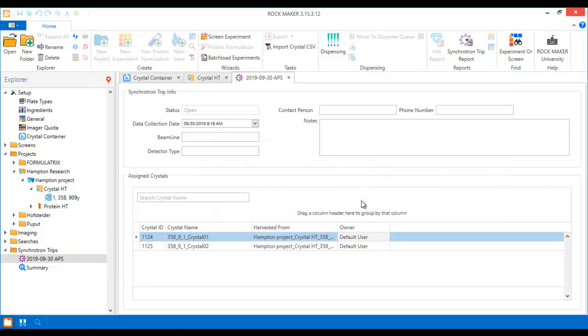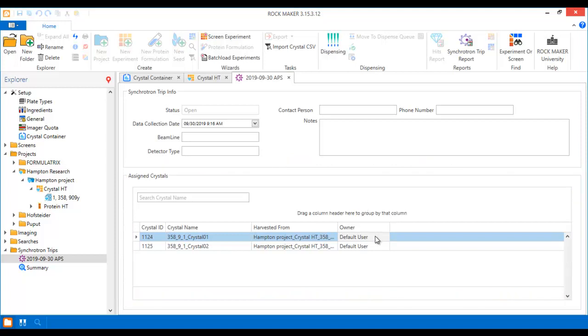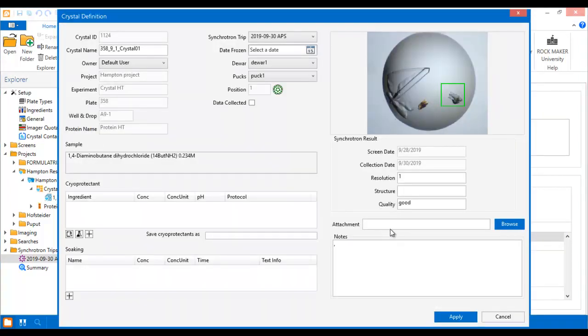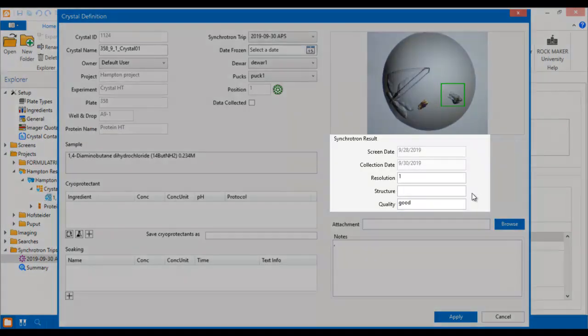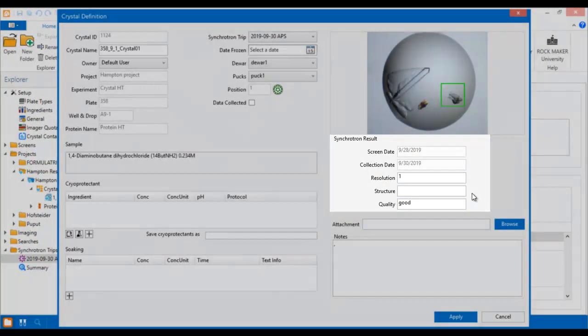After you've imported your diffraction data, you can review it in the Assigned Crystals panel. You will see the list of all of the crystals that have been analyzed in this panel. Double click any crystal from the list to open the Crystal Definition window and see the details of the diffraction data in the Synchrotron Result panel.